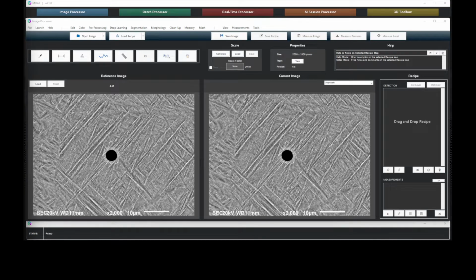When performing characterization of alpha-beta phase fraction in titanium alloys, EM imaging data can pose challenges due to variation and noise. When measuring phase fraction, it is critical to exclude inclusions such as pores from the phase fraction calculation.